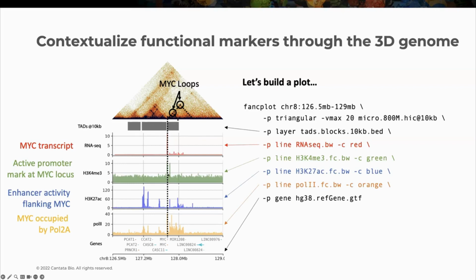There's a very strong enhancer at this region. So this is an enhancer promoter interaction, and it's a less common data type, but pol2 occupancy shows you that it's not only the MYC gene, but this entire locus here is occupied by pol2, indicating active transcription. So like I said, visualization is worth a lot in our data type, especially when you're starting to view different pieces of information together. And you can derive a lot of biological insights just by throwing it into a viewer.